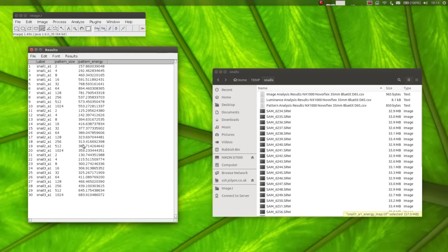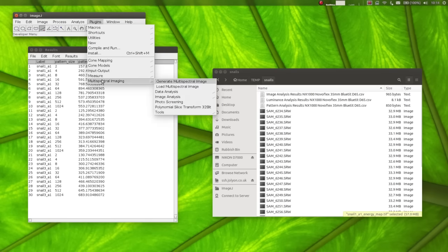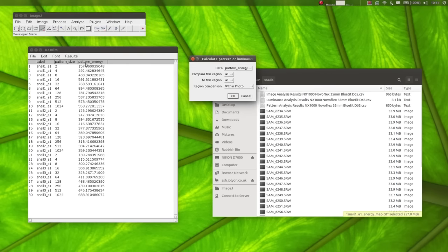Next, if we want to compare the snails to each other, we can do a simple image analysis. So if we go data analysis, pattern luminance distribution difference calculator, this will allow us to compare the patterns of the snails to each other. So here, select pattern energy as the column containing all the useful data. I want to compare the region A1 to the region A1. So in this case, I'm comparing snail A1 in this image, and I want to compare it to the snail A1 in this image and this image.